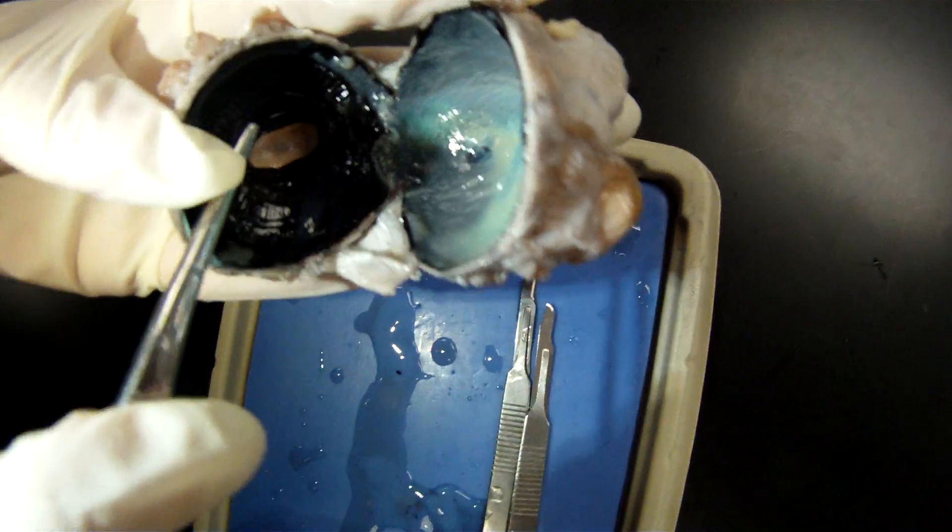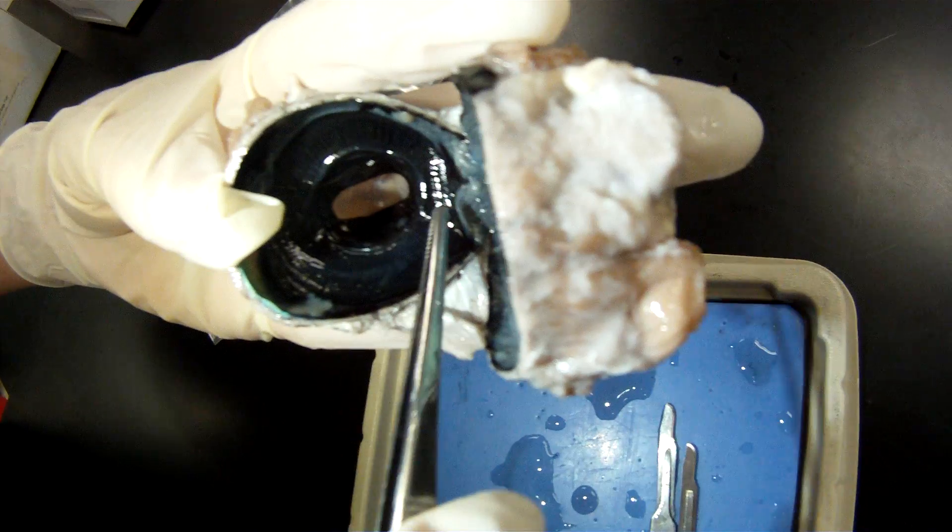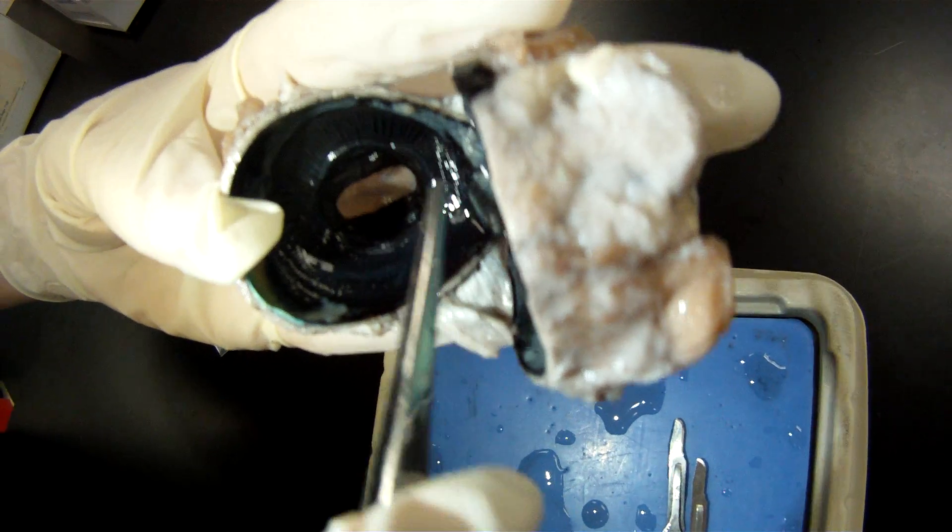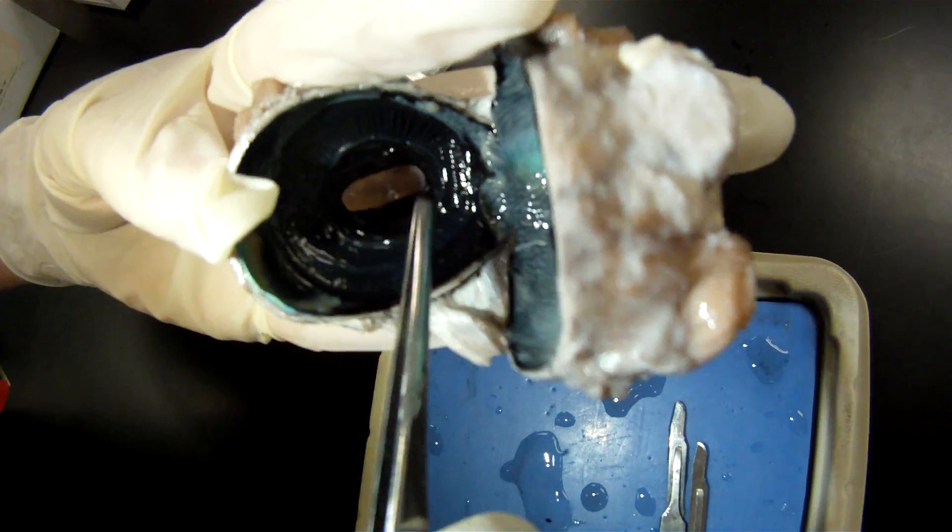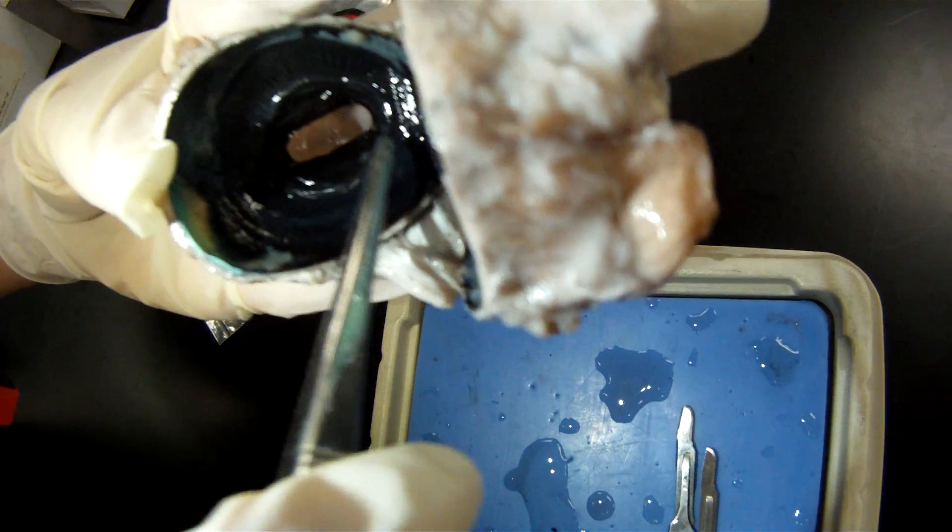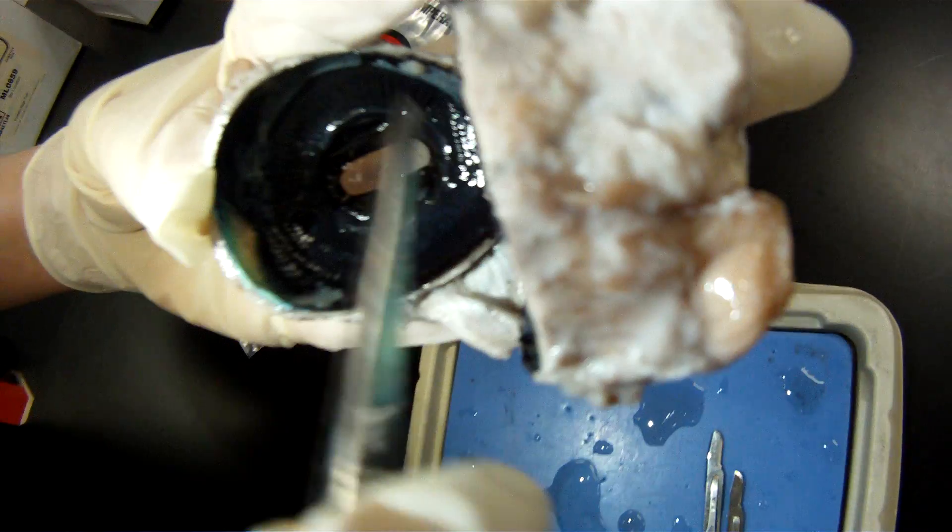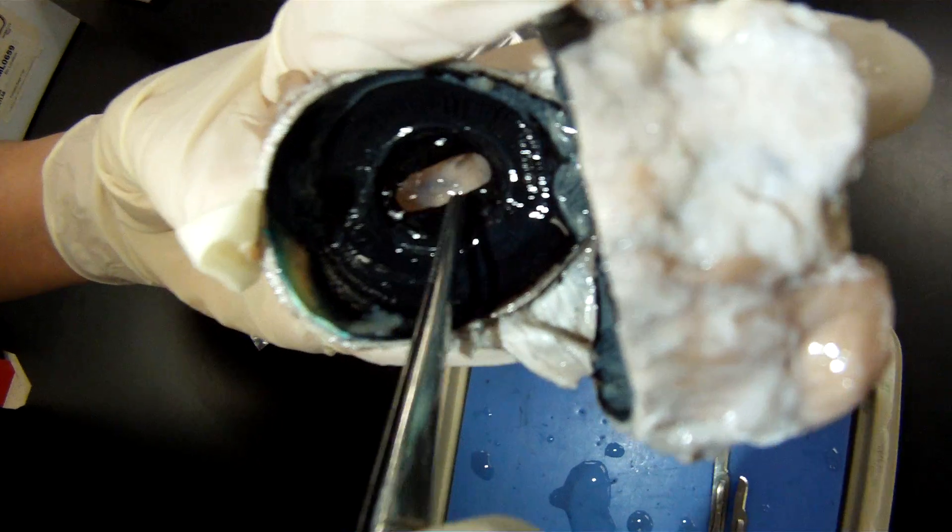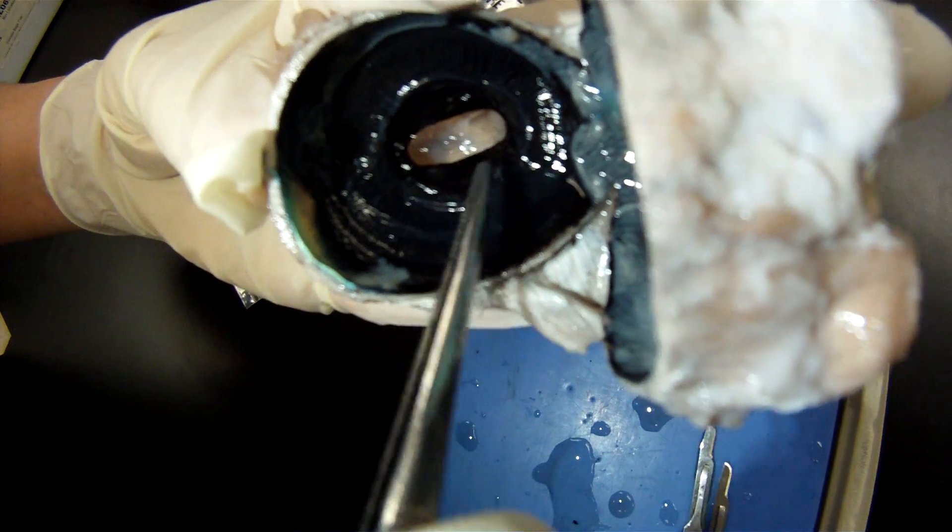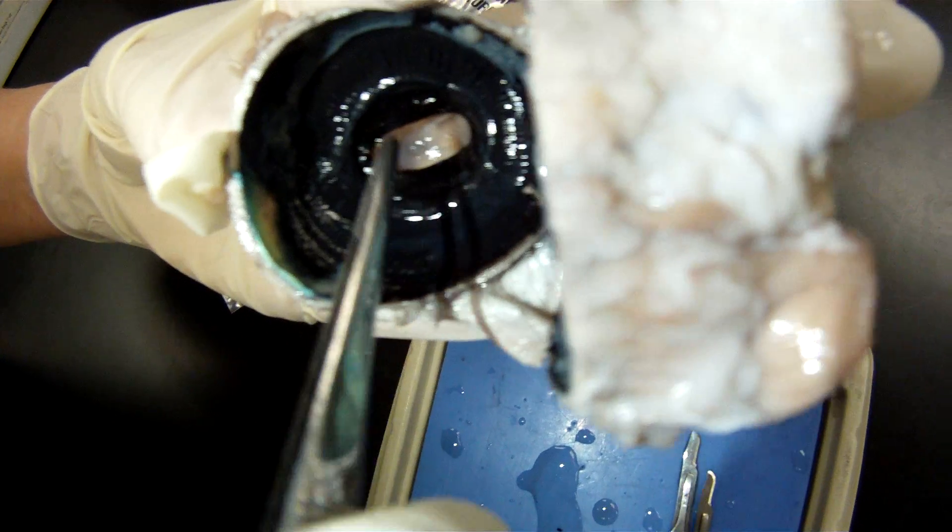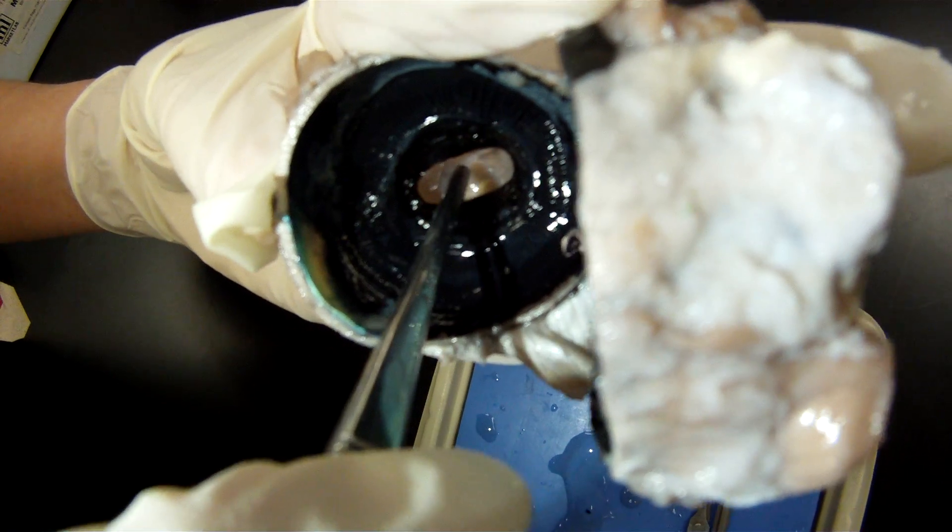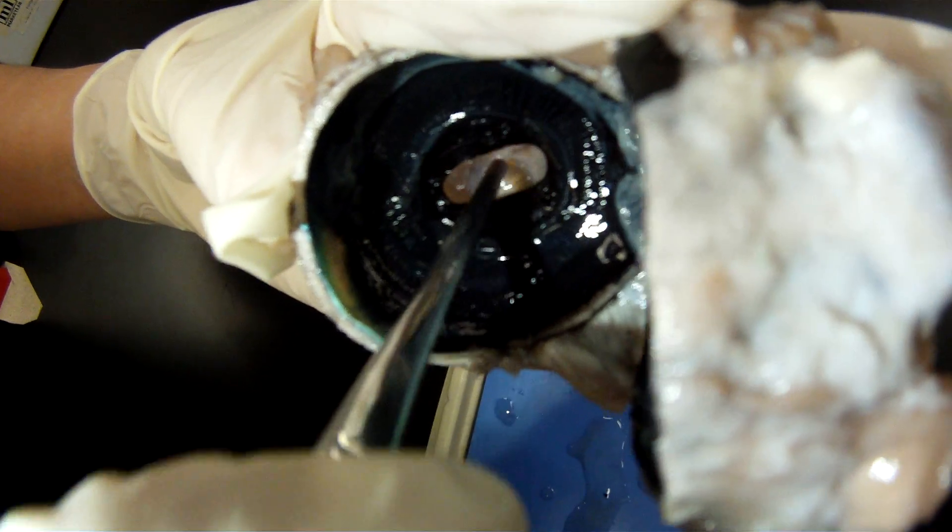We've got the ora serrata, where the retina meets the ciliary body, all the way around. This portion here that is flat and not striated is the iris. This portion is the pupil, and this is the cornea.